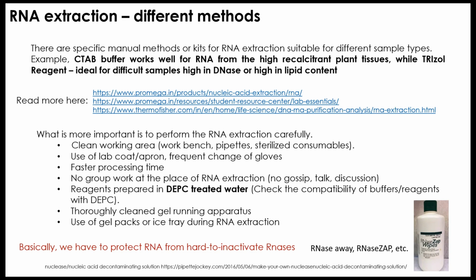You have to use DEPC treated water for reagent preparation, not necessarily, but if you have doubt that your distilled water or your Milli-Q water is giving you more trouble, then it is better to use DEPC treated water.